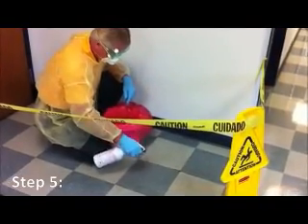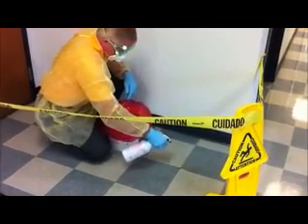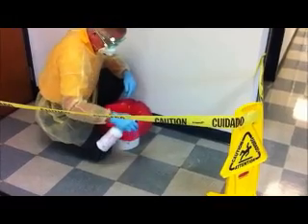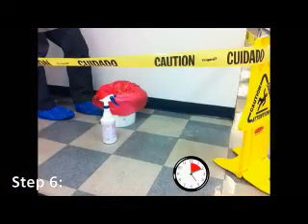Step 5. Liberally spray the affected area with the Envirox TB ready-to-use disinfectant, using the trigger spray head provided in the kit. Allow the Envirox TB disinfectant to sit for 10 minutes for proper disinfecting.